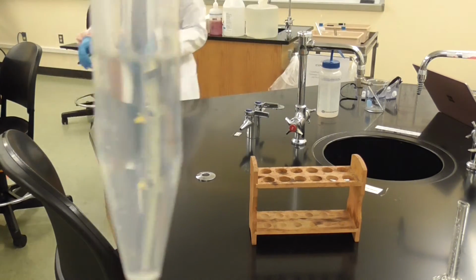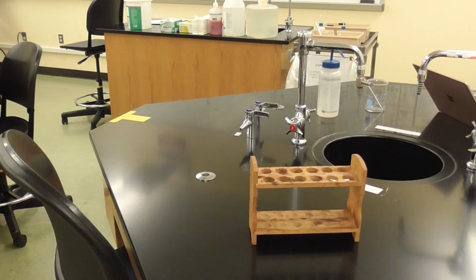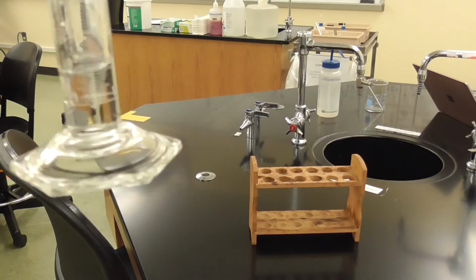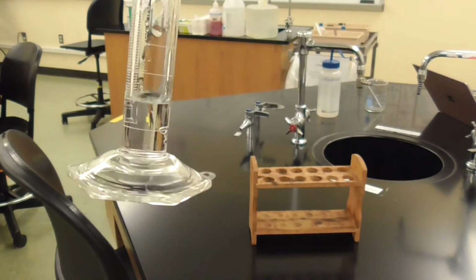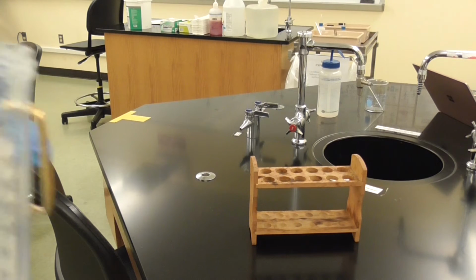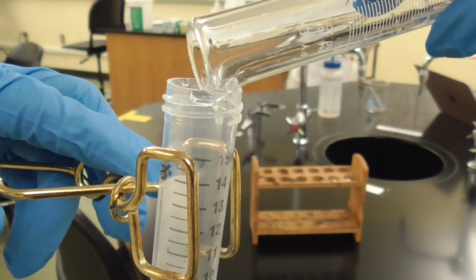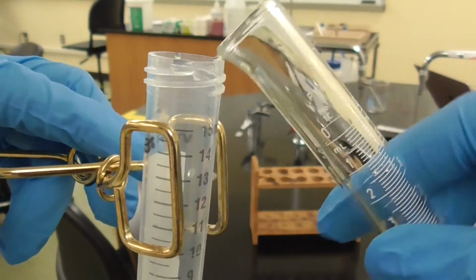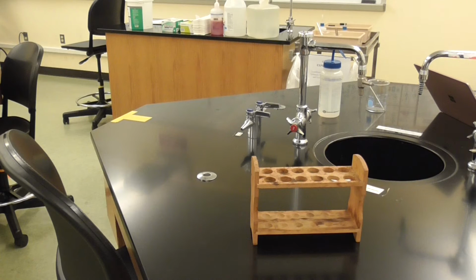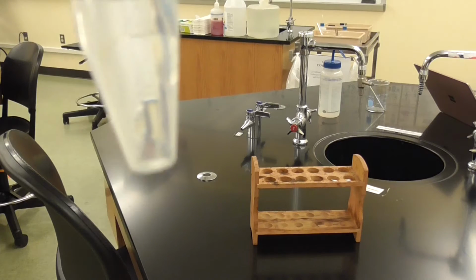And now we're going to add 2 milliliters of methylene chloride to the caffeine and distilled water. And now you mix.